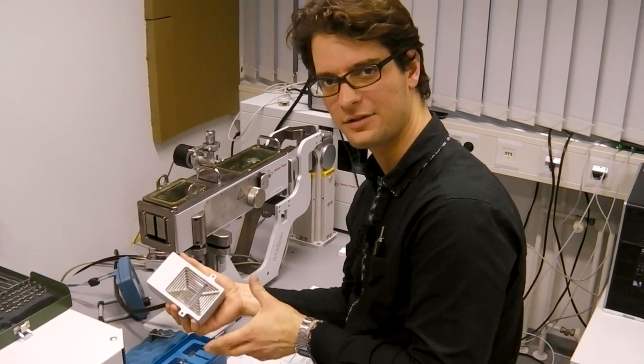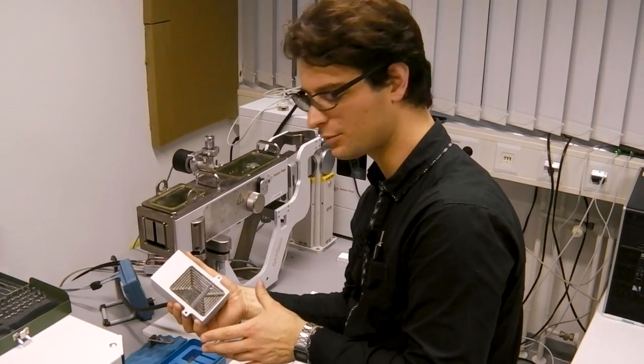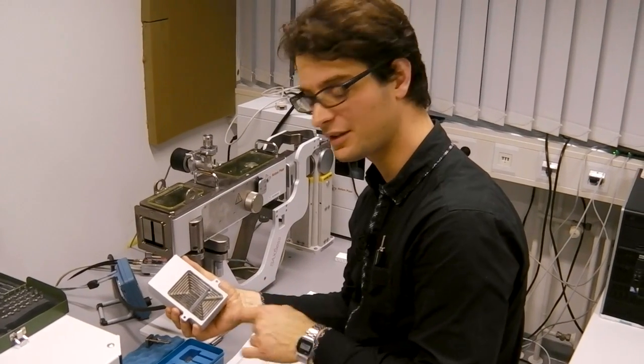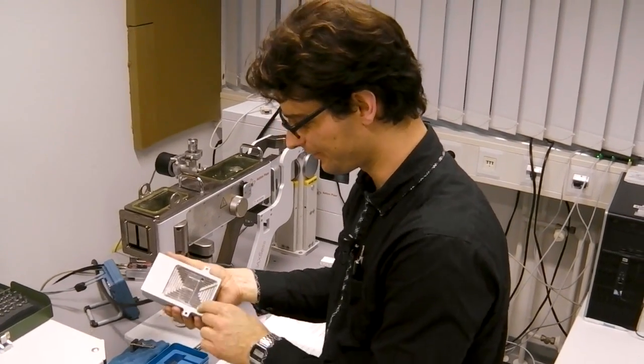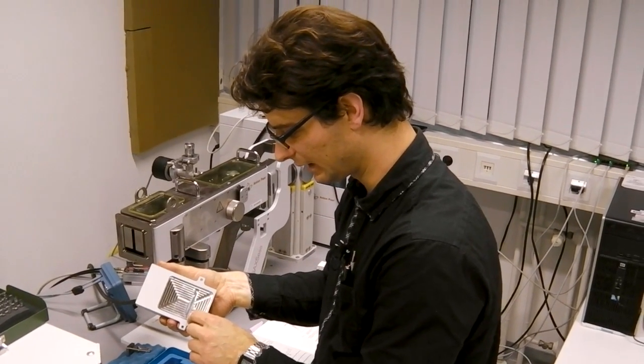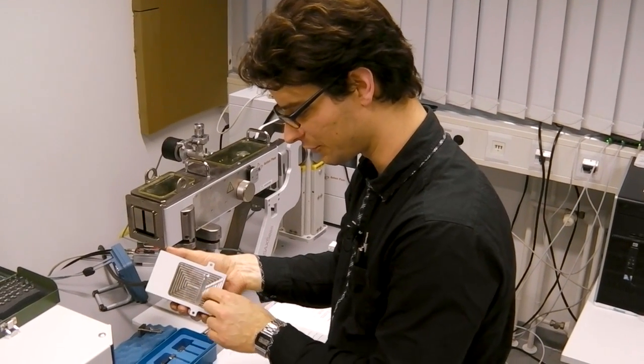This is the detection system on our instrument. It's a Dectris Mythen detector, which is a one-dimensional strip detector that sits right behind this entrance window.